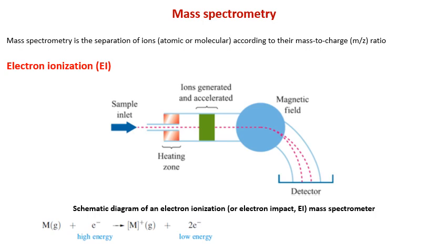For an ion having z equal to 1, that is charge equal to 1, the m/z value is the same as that of the molecular ion. But if your charge is 2, for example z is 2, then the recorded mass is half of the actual mass, because whatever your mass is, when you divide by z equal to 2, the m/z value will be half, and so on. So in EI mass spectrometry, most ions have z equal to 1, but you also get the fragmented part also.